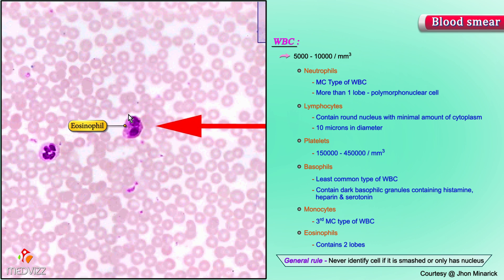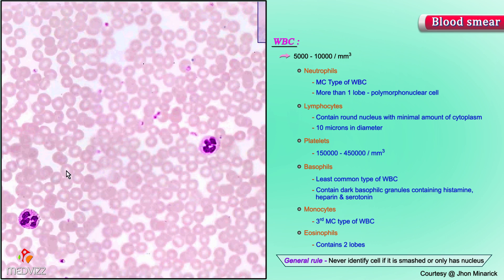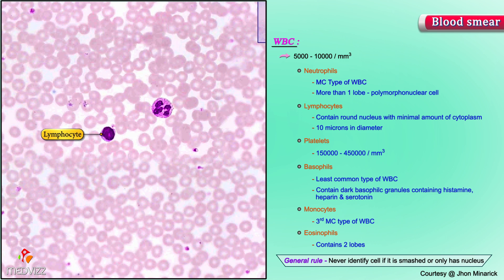So I think we covered it all — the red cells, the platelets, the neutrophils, the eosinophils, the lymphocytes, and we had a nice macrophage and a basophil as well. On the basis of the few things we looked at here repeatedly, I don't think there is anything on this slide that you cannot identify if somebody asked you to. Thank you very much.